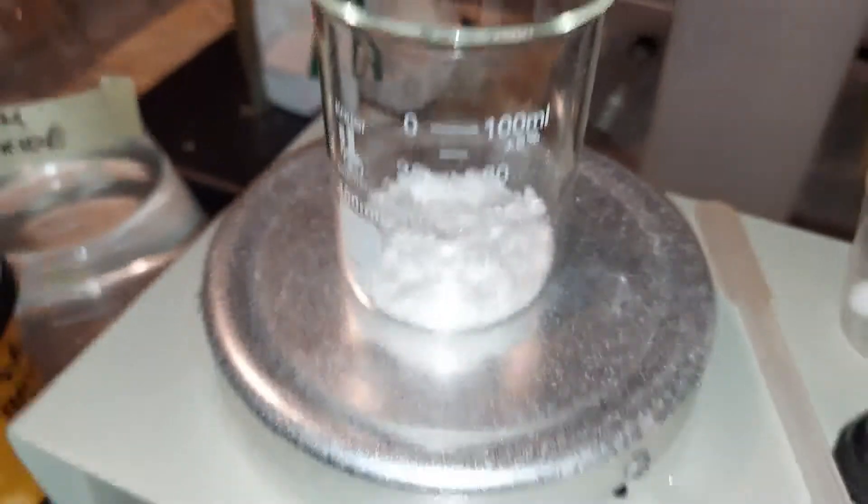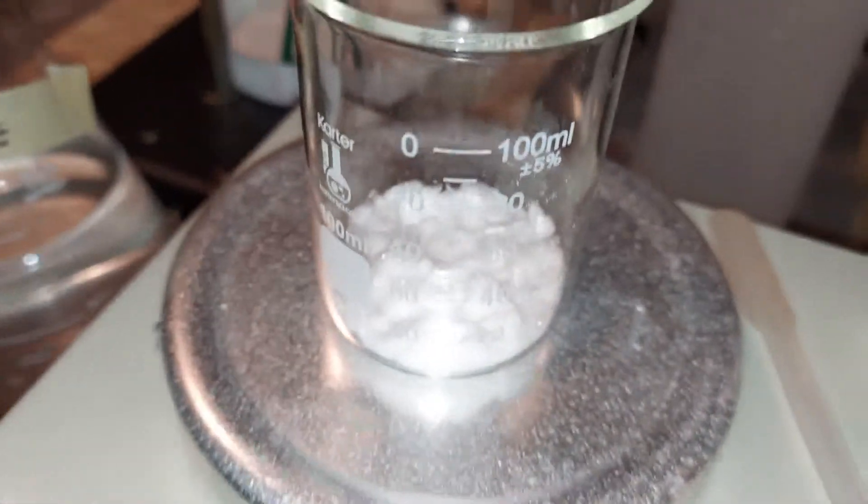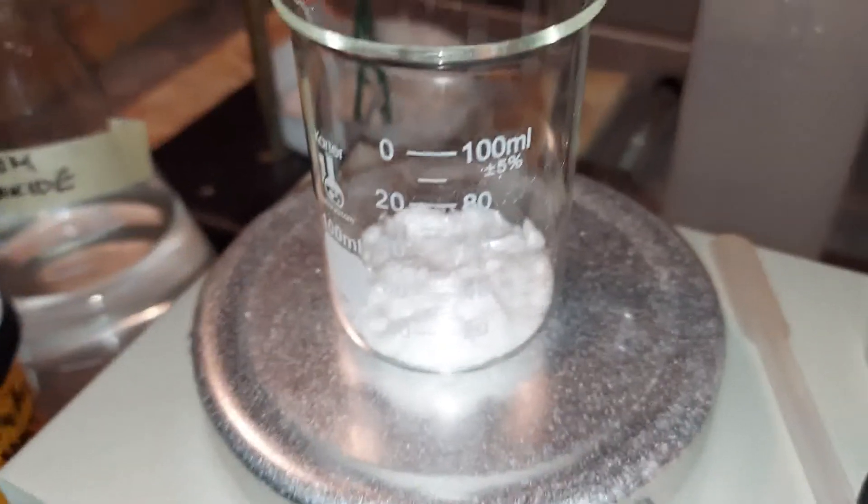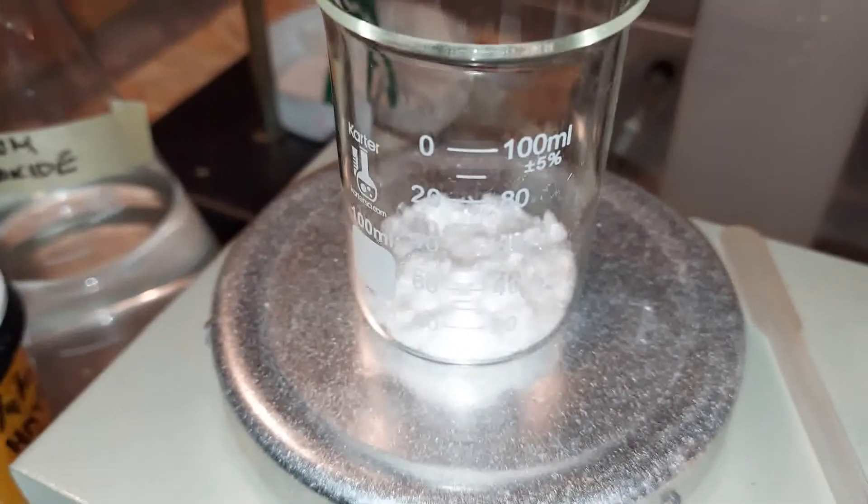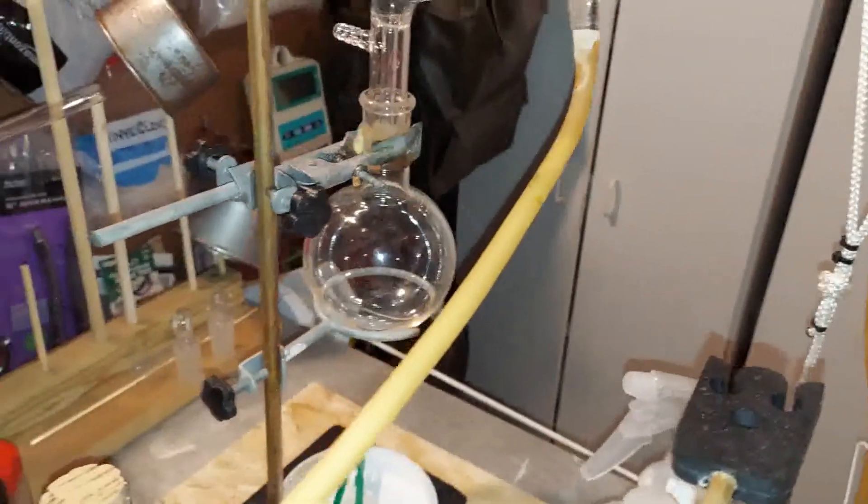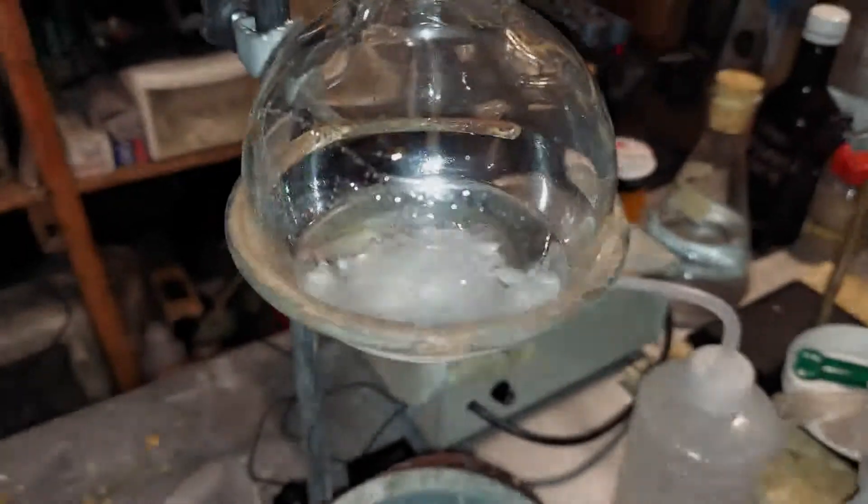All right, here is the calcium chloride. It's been heating for a good, I don't know, 10-15 minutes. It should be pretty free of water by now. There's approximately 10 grams there, and I'm going to be next adding it to here, which is our chloroform, which will be connected to our distillation apparatus.